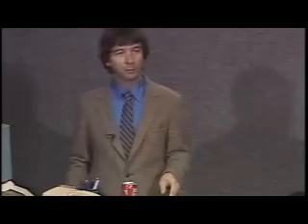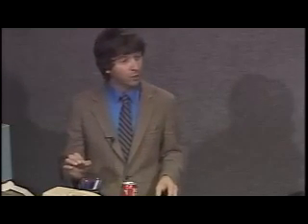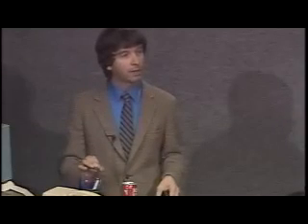And the answer to that question is yes, and the physical phenomenon that describes that process was discovered in Erwin Mueller's laboratory in 1956 when these first images were produced. That process is called field evaporation. Like thermal evaporation, but a high field at low temperature causing the effect.